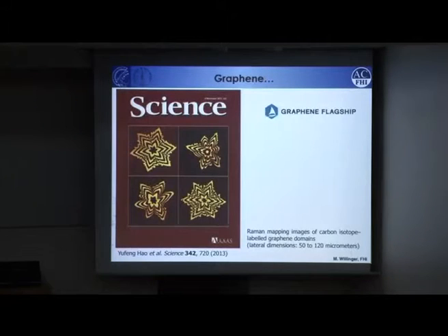And we use this microscope, amongst other things, to study the growth of graphene. So graphene is a very hot topic, there's lots of money in research of graphene. And because the growth happens at a very high temperature, for example on copper you go to 1000 degrees, and what is growing is just a single atomic layer of carbon, it's difficult to understand actually how it grows. So people have figured out lots of complicated experiments. Actually this is from 2013. A group used carbon isotopes.